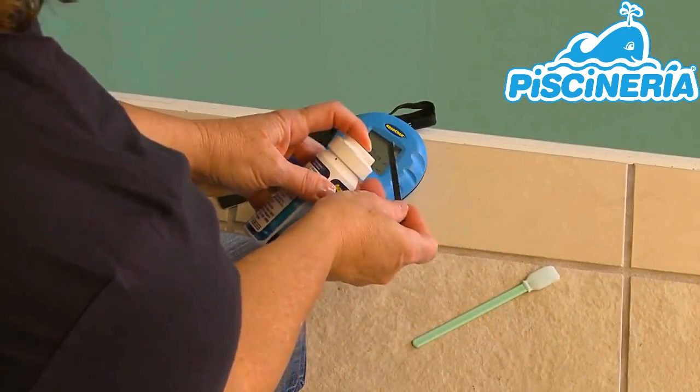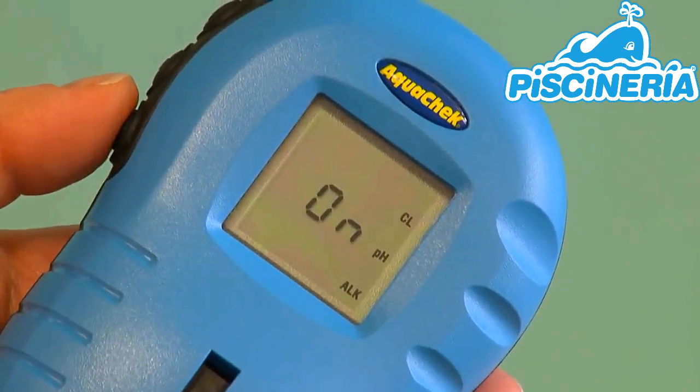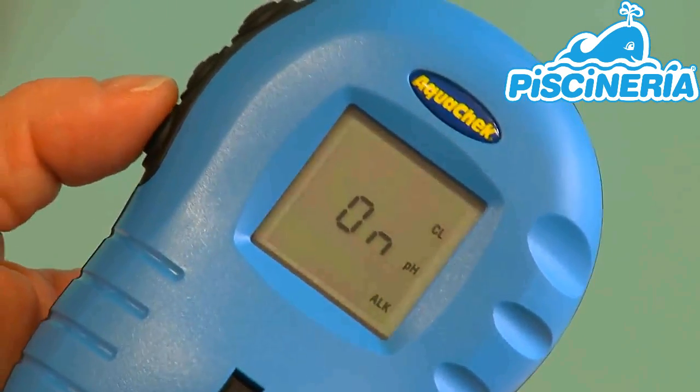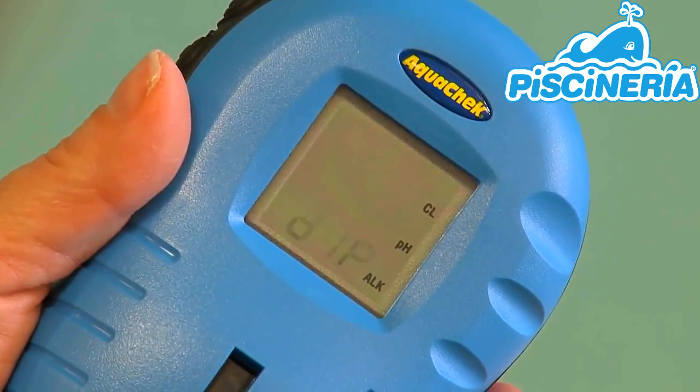Next, remove one test strip from the bottle and tightly reseal it. Then press the bottom button located here on the reader. The display will show a countdown of 3, 2, 1, dip.